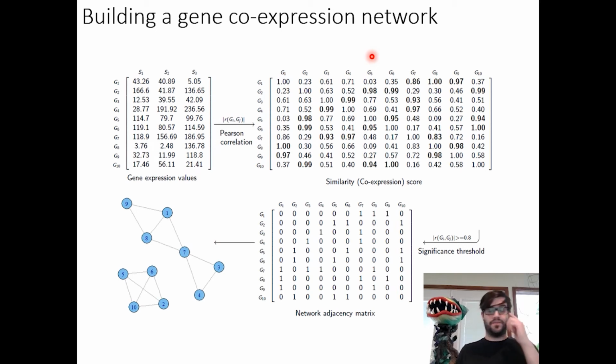And so the general way that a co-expression network works is we have, again, our expression matrix, where we have our samples here as columns and individual genes as rows. Typically, the more samples you have, the more power you have. If you just have 3 samples, you're not going to have a lot of statistical power because you'll have a lot of spurious data points. But if you have 10 or 20 or 100 different samples, you get a much better survey of how genes are interacting with each other across all of these samples.